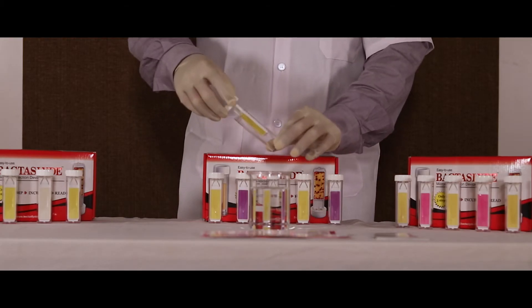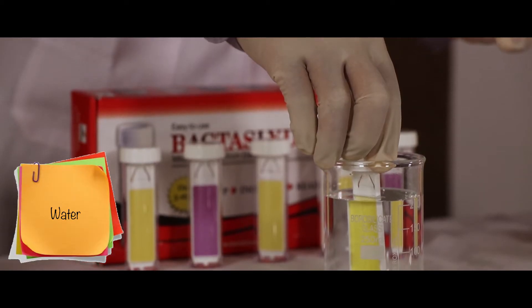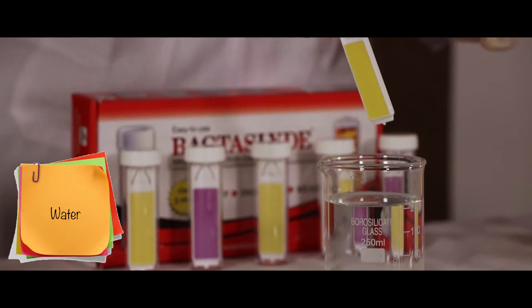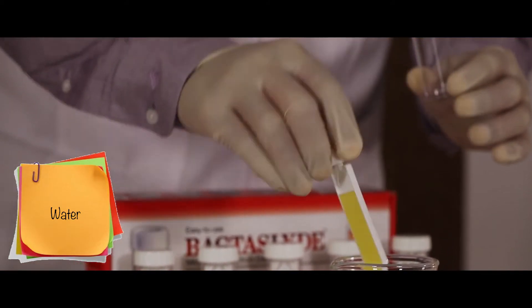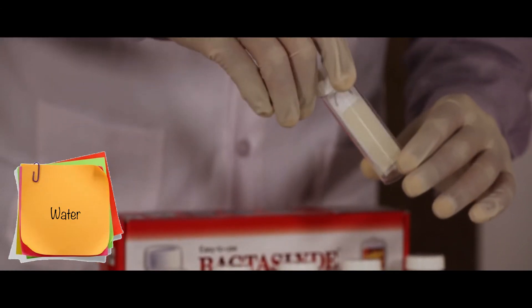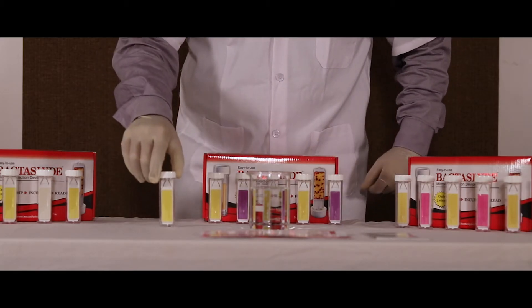Let's start the procedure by testing some samples. Open and dip the slide in the water for 30 seconds. Remove the slide and gently shake off excess liquid. Screw the slide back in the tube. Keep it at room temperature for 18 to 24 hours.